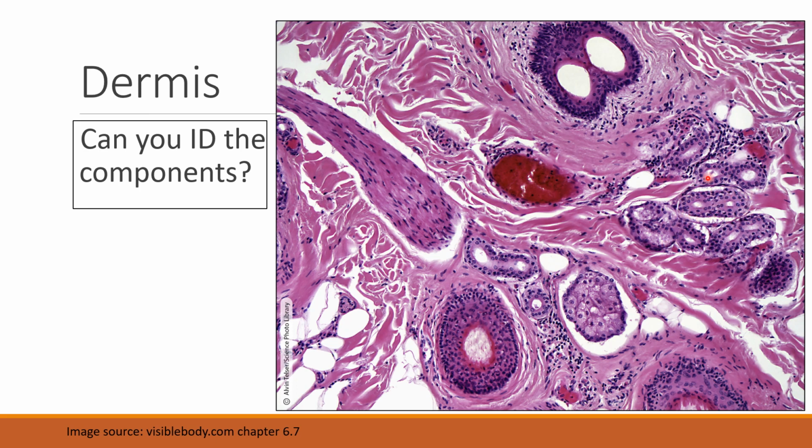This is a tubular gland, right? So lots of these are cross sections. You can imagine the tubes swirling around and back and forth like so. These are collagen fibers. The nuclei of probably a bunch of fibroblasts are over here. This section over here looks like adipose tissue to me, in this little area here.